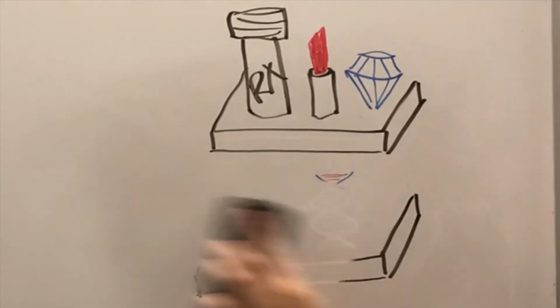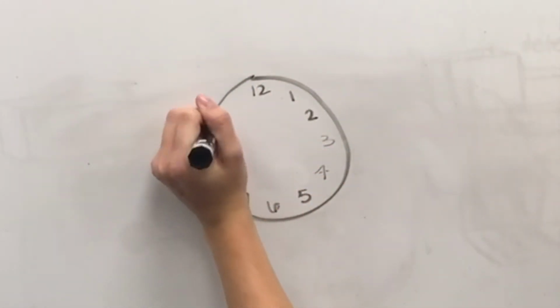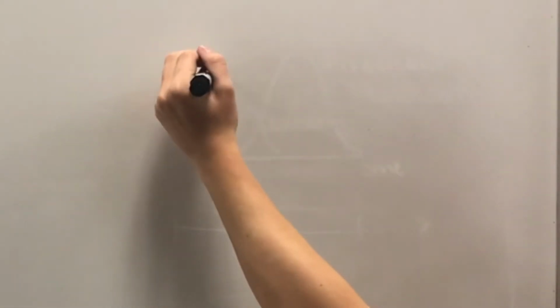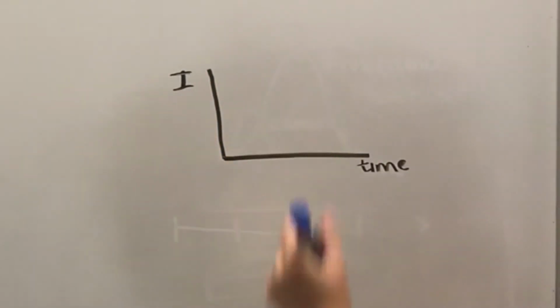Due to the weakness of the Raman effect, there are several limitations to the technique. Overall, the technique requires sensitive and highly optimized instrumentation. Long acquisition times and often sophisticated data analysis is necessary. The primary limitation is the presence of fluorescence in certain samples, like proteins and minerals.